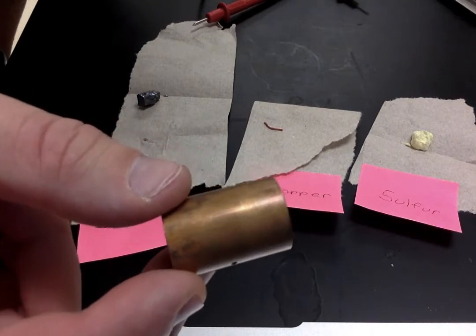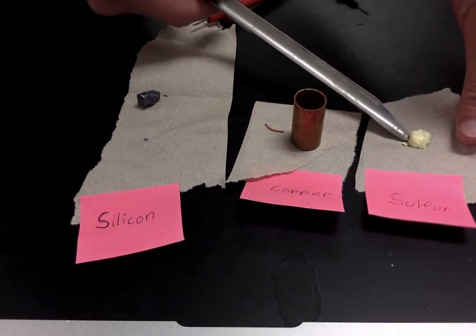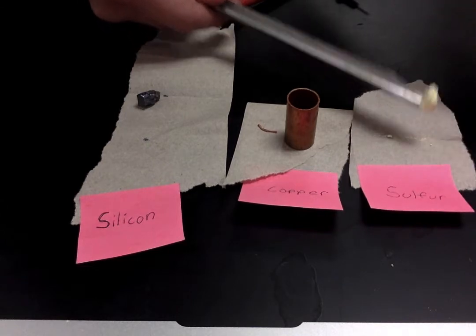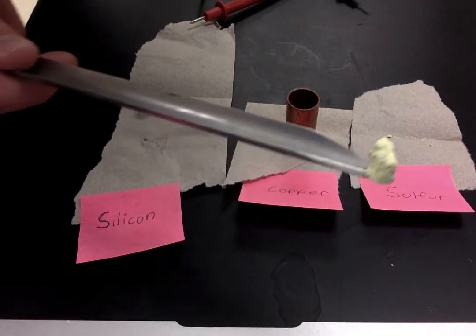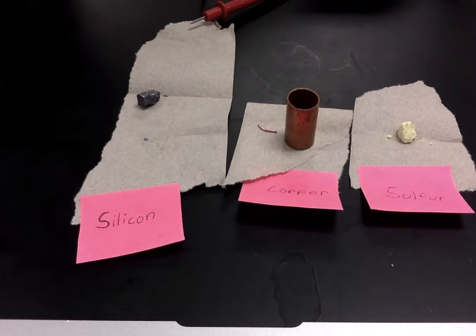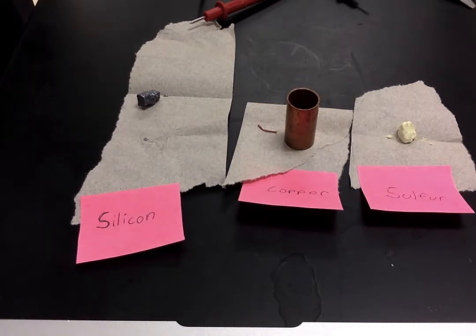Here we have copper. And one more time with the sulfur on the spatula. Okay, so rank them. Which one's the shiniest? That one has the most luster. Give that one a 1. Which one's the dullest? That one has the least luster. Give that one a 3.